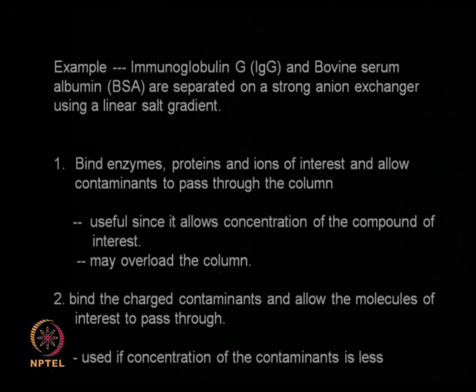because compound of interest keeps on binding to the stationary phase, and after some time it will not be able to bind. Another approach is to bind the charged contaminants and allow the molecules of interest to pass through. This is a very good technique if the contaminant concentration is very less. So all the contaminant will be retained inside the column, whereas your product of interest will be leaving the column continuously. So we can think of both the approaches, either bind the product of interest in the column, thereby getting rid of contaminant initially, or bind the contaminant and allow the product of interest to elute out first.